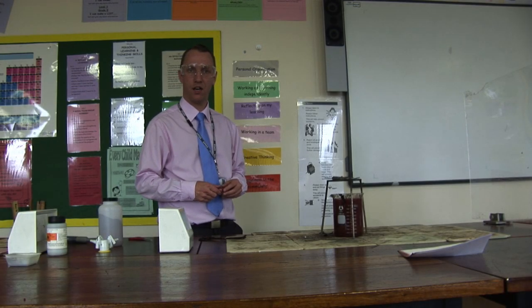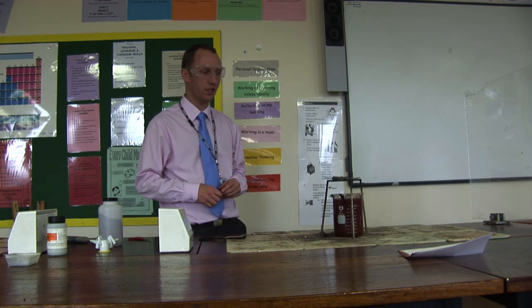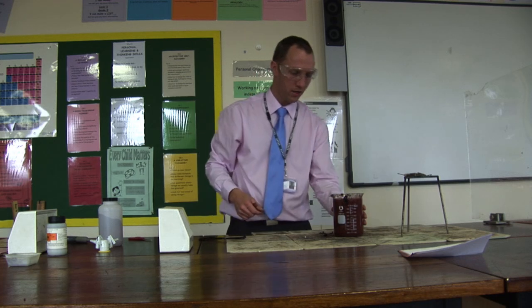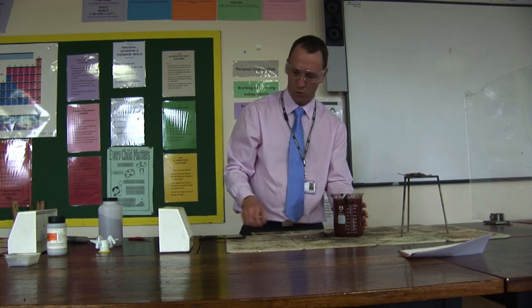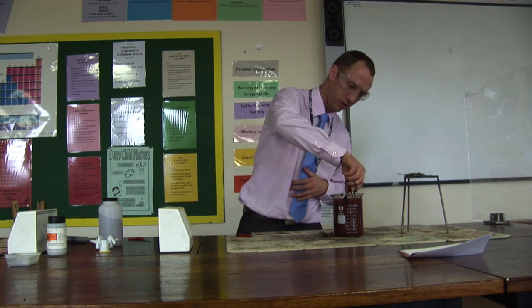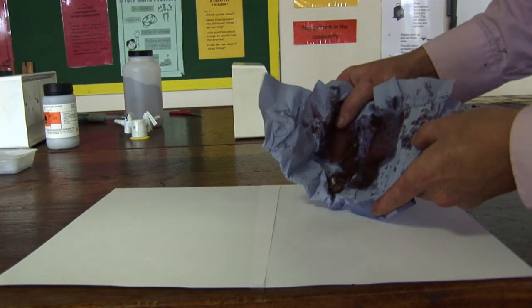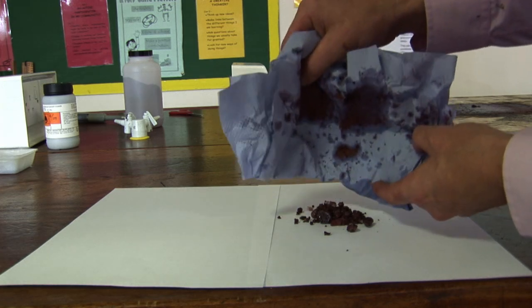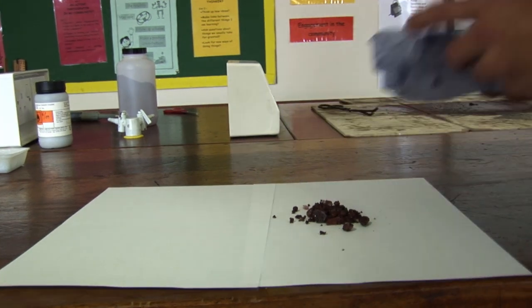We've waited for half an hour to make sure that everything is totally cool so we can begin to move the equipment out of the way. The water is still a little bit warm, but in here we will have our products and we can have a closer look at those. I've taken them out of the water with a sieve.